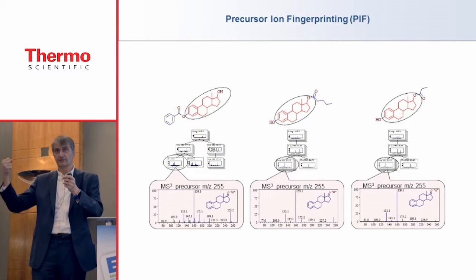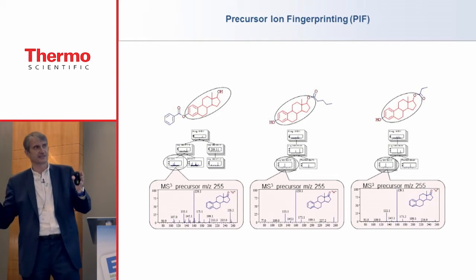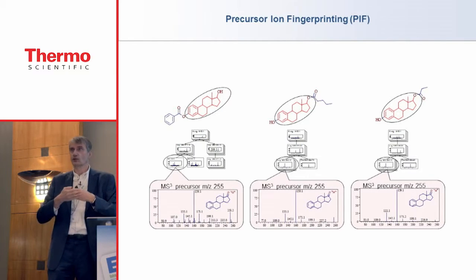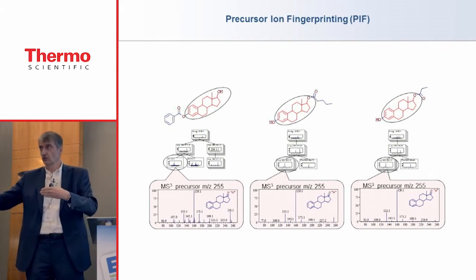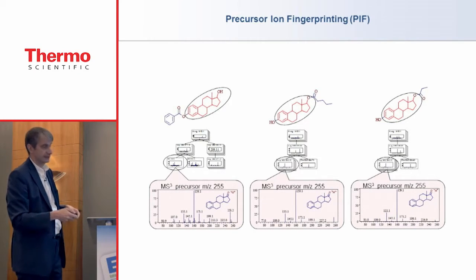So once we isolate a fragment and do an MSn spectrum, we will always get the same spectrum. Not the same, so I would rather say matching spectrum. The only thing the ion remembers is its internal energy, and we can compensate these internal energies by spectra acquired at various collision energies. So if this one would be unknown, and those would be in a database, we could at least identify the substructures based on these spectra.